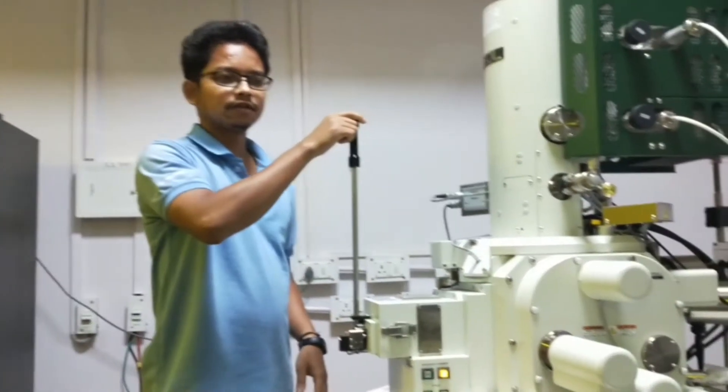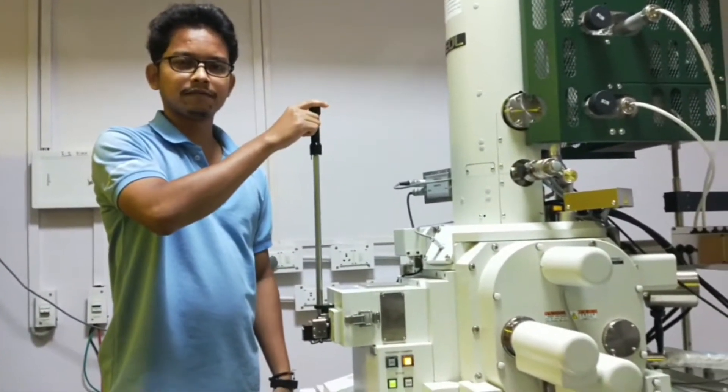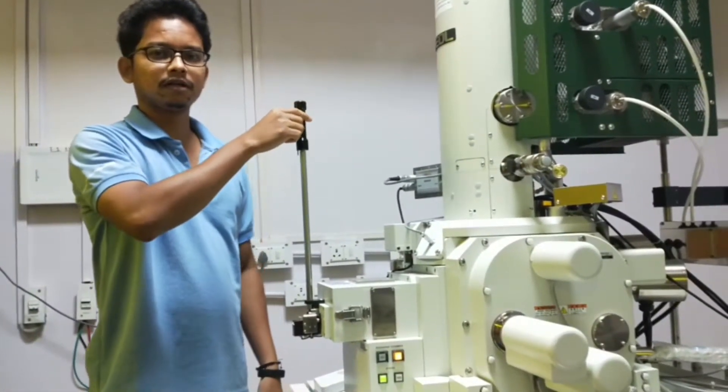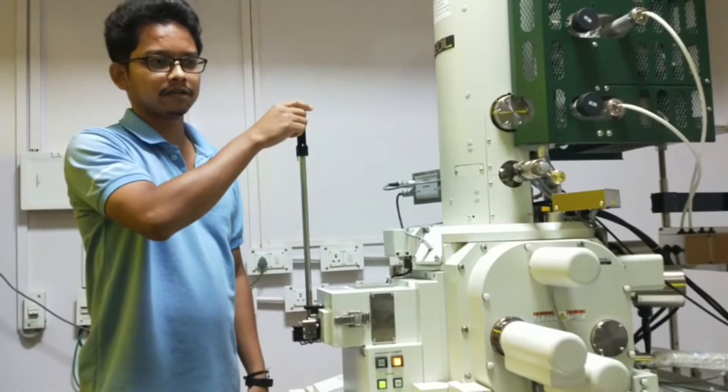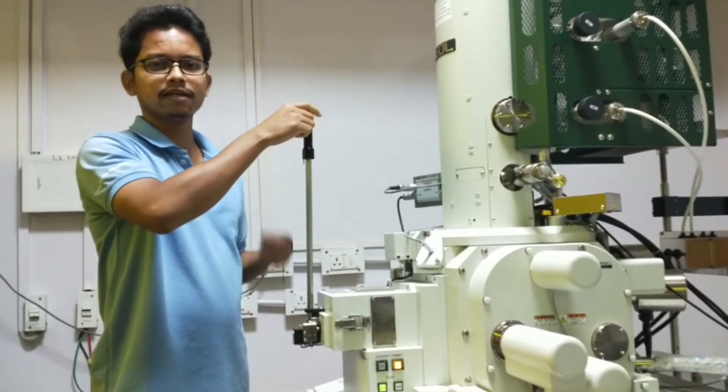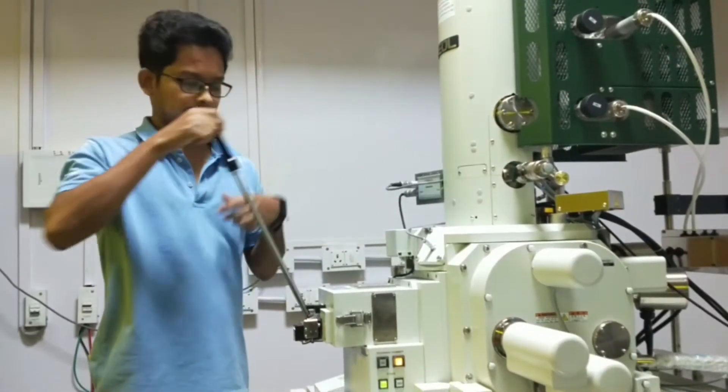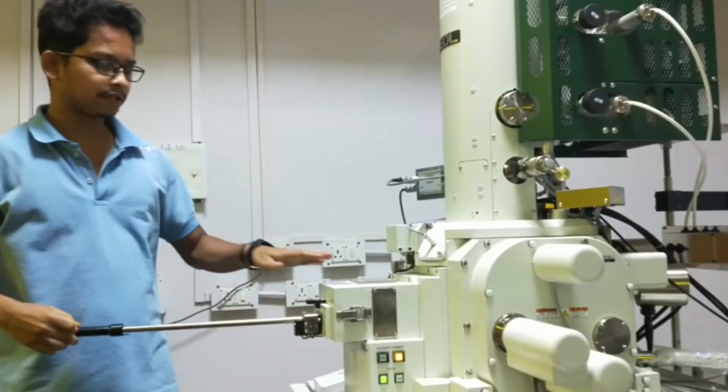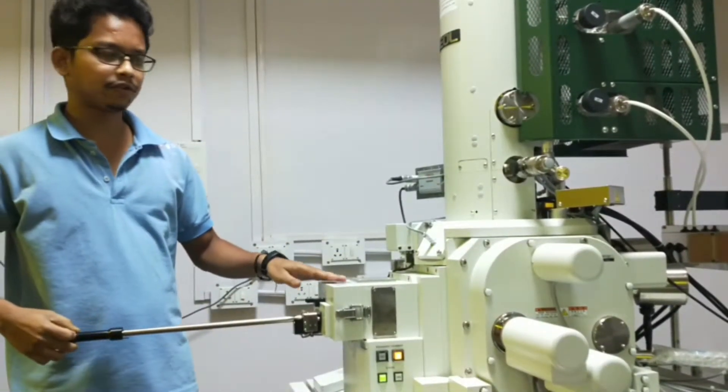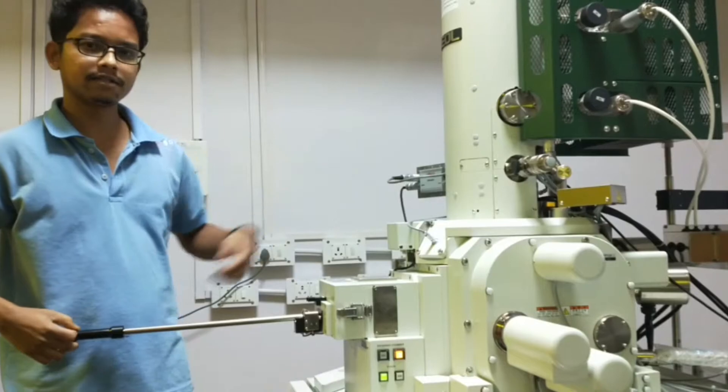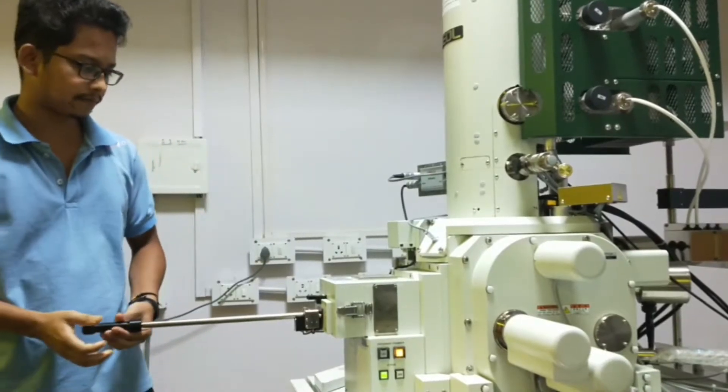As now the pressure has come to our requirement, we can insert our sample from the specimen chamber to inside the FESM.